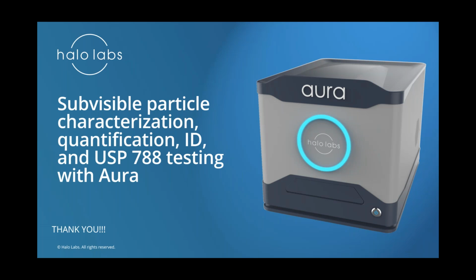The inter-instrument variability is much, much lower than 3%. So it's important to realize that the variability isn't necessarily in the instrument, it's actually in the samples. Sometimes even when you run lots of volume and sample, the CV essentially stays the same. That's an inherent characteristic of these samples. So the short answer is that it depends on the sample.